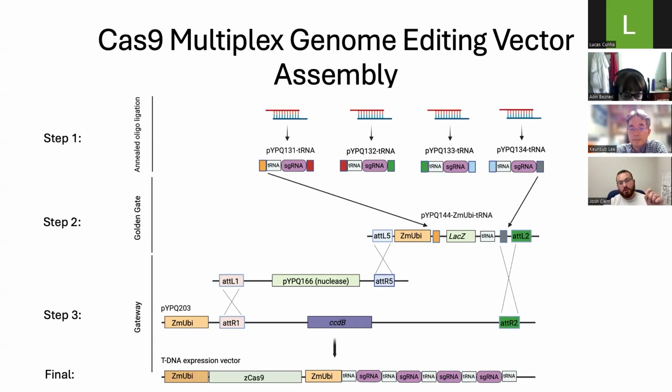So using the hammerhead HDV strategy for multiplex genome editing with Cas9 can be needlessly complicated when we have a tRNA processing strategy that you don't need to adjust any other parameters about the tRNA sequences themselves. For Cas12a, you don't have to worry about it because the stem loop is at the 5' end of the guide and it remains the same. So you can use the hammerhead without modifying it every time.